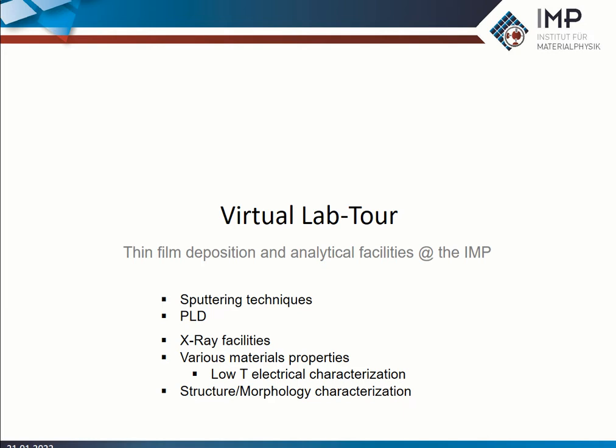Welcome to the grand tour through the thin film deposition and analytical facilities here at the Institute for Materials Physics. At first I'm going to focus on the deposition side, namely the sputtering and the pulsed laser deposition, and afterwards I will show you some pictures of our X-ray facilities. We have quite a bunch, I'd say. And afterwards some materials properties or characterization units we will also have a look at.